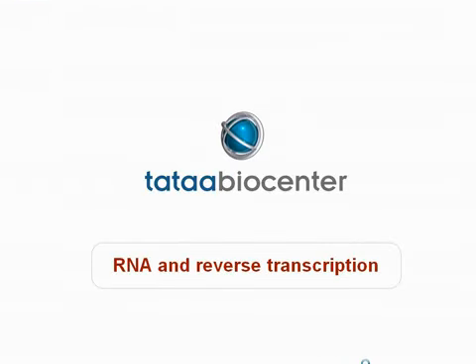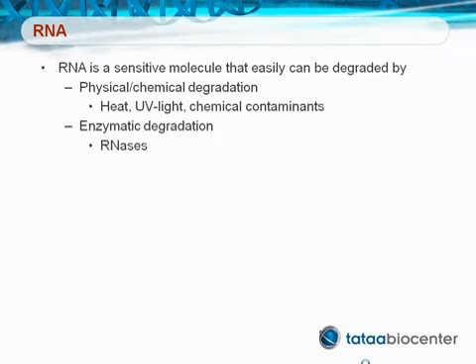Let us now continue and talk a little bit more about RNA and the reverse transcription reaction. RNA as such is a much more sensitive molecule than DNA and can easily be degraded or modified by different means. If the RNA is degraded, it can of course affect the quantification of the original number of RNA molecules. RNA can, for example, be degraded by different physical and chemical factors, for example heat, UV light, and different chemical contaminants that are present in the sample or introduced during the processing.